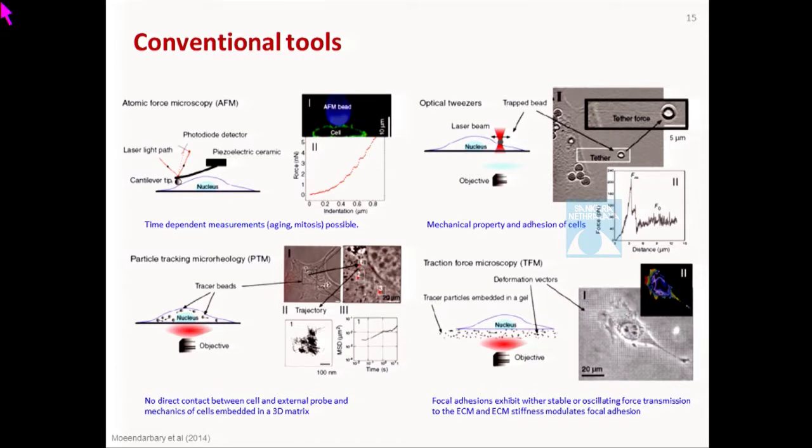And then you have optical tweezing. In optical tweezing, as I was showing for the infected RBC case, you have beads typically attached to the cells, and then you shine a light beam. As compared to the environment, the cells have a different refractive index.